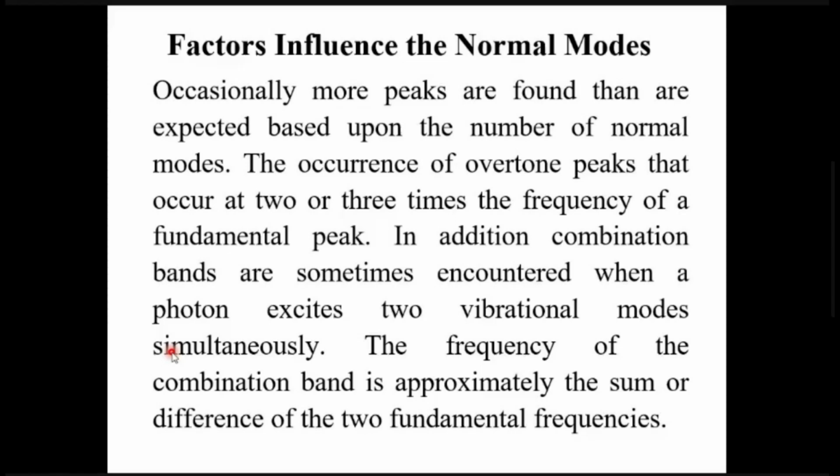But in IR spectra, many times you observe bands which have no theoretical explanation in the normal mode of vibration explanation. We cannot explain those peaks using the theory behind normal modes, so there is some other explanation.